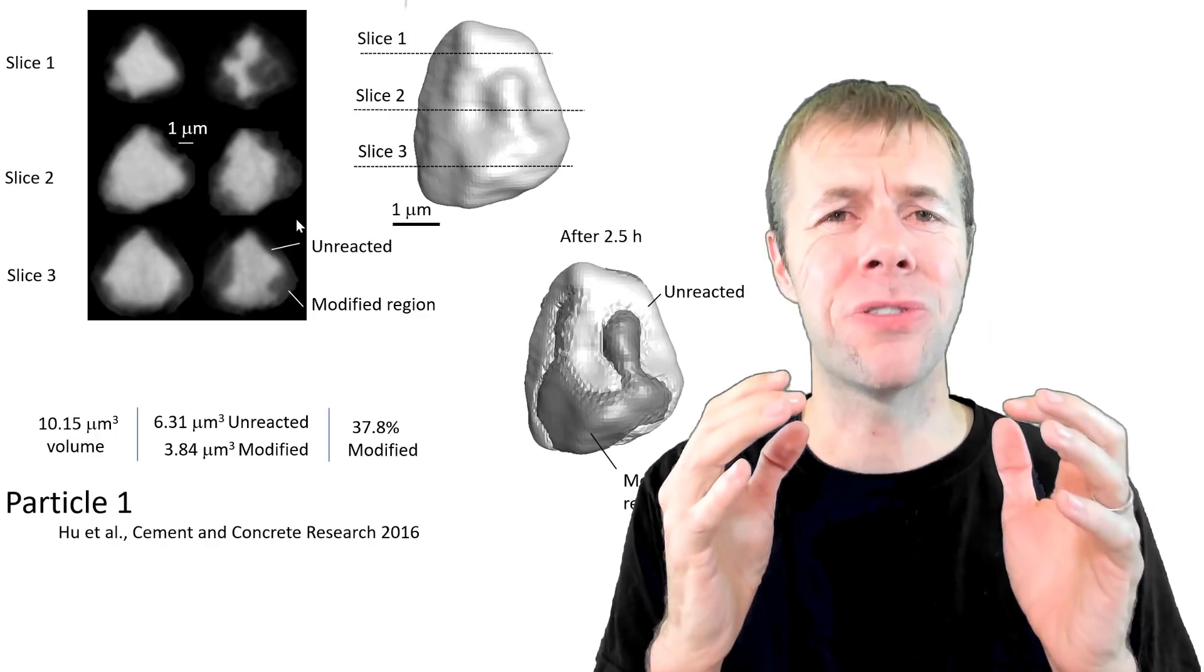Also, I know some of these gray values form. It doesn't go outside of the boundary of the particle. It stays inside the original boundary. How interesting. We're going to call this for now the modified region.